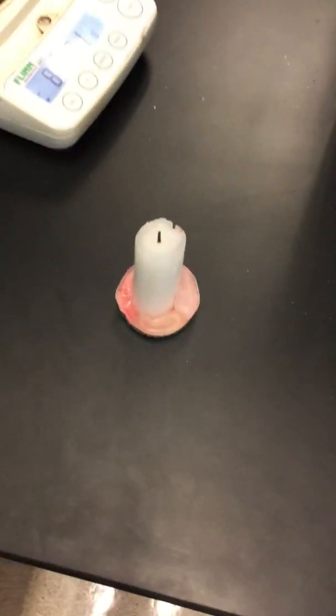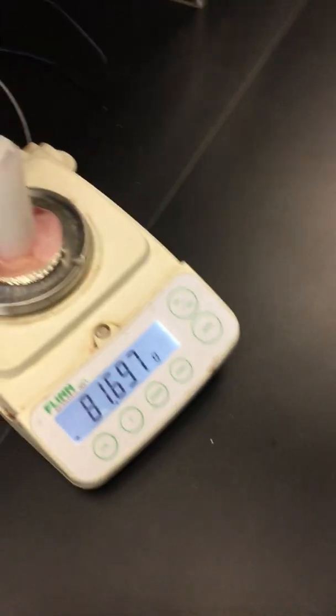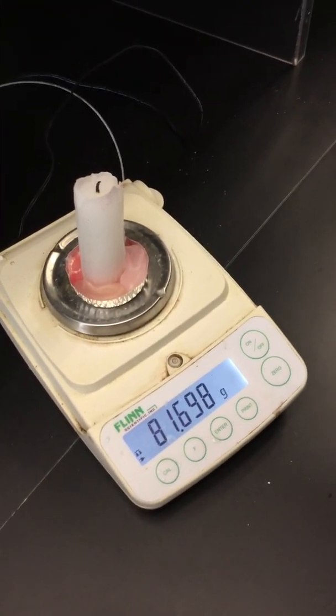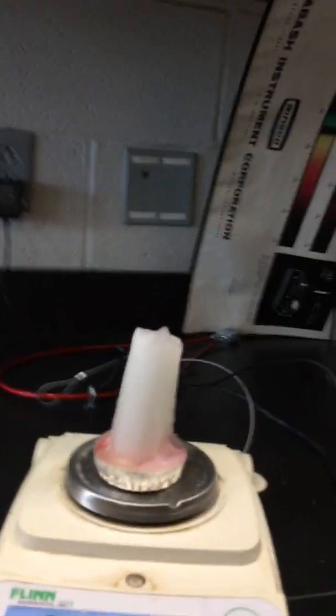Station 9 has some interesting stuff going on. We've got ourselves a candle, and our candle is right here. We're going to figure out what sort of mass this thing has. When I throw this on the balance, you'll notice that my candle has a mass of 81.697 grams. Now I'm going to go ahead and light a match.